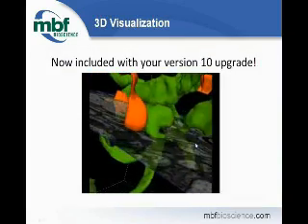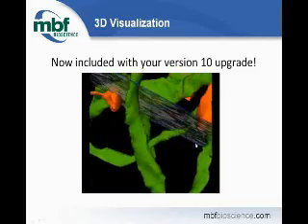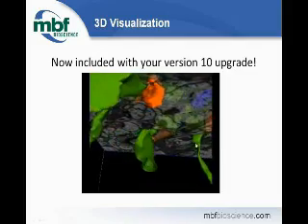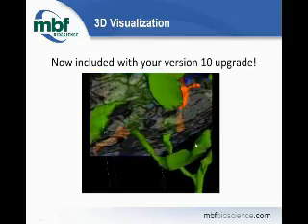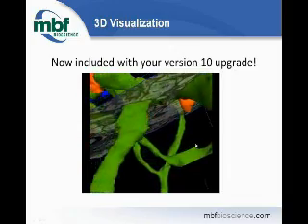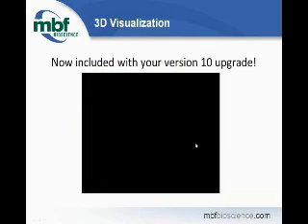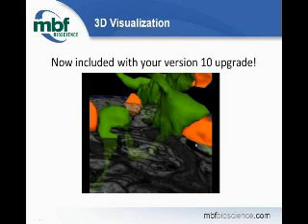Many of you are familiar with our 3D visualization module, and now it's free. It's included with your version 10 upgrade. You can transform your serial section tracings into realistic 3D models. You can create models with your tracing data overlaid with the images, as you saw here, so long as you have the image stack module. You can rapidly generate publication quality graphics and animation.